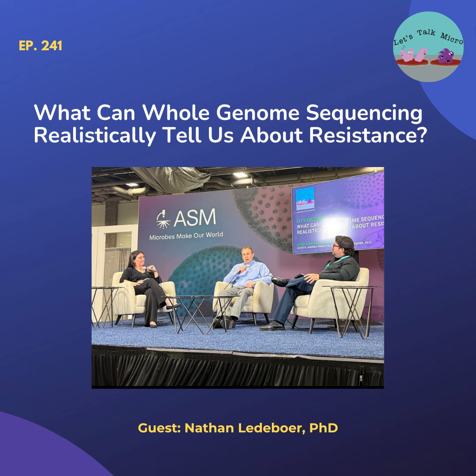So I think one of the biggest challenges with next generation sequencing is we have to go back to our roots, and we really have to remember how to do molecular biology. What are those good practices that are associated with it? Because today, as the technology currently stands, NGS is going to be a bit more manual. We're going to have to do extraction. We're going to have to do library prep. We're going to have to put it on the sequencer, and then we're going to have to do all the bioinformatics. So all those manual steps are things that we're going to have to get a bit more used to, at least for the medium term.